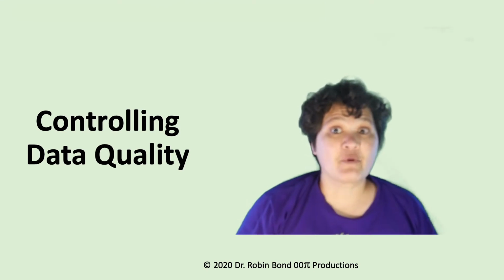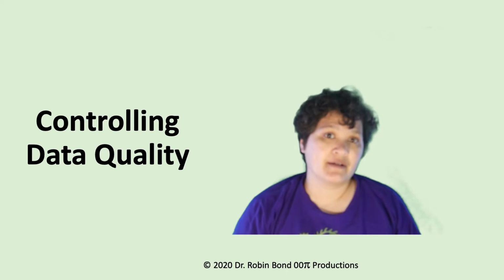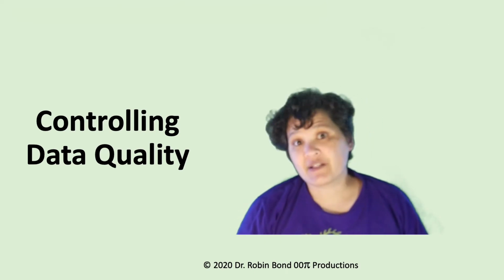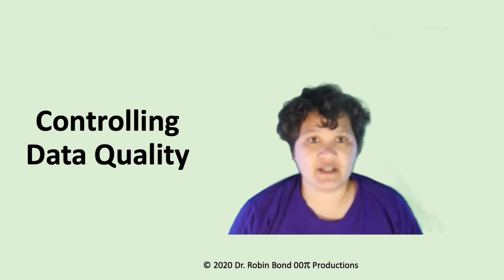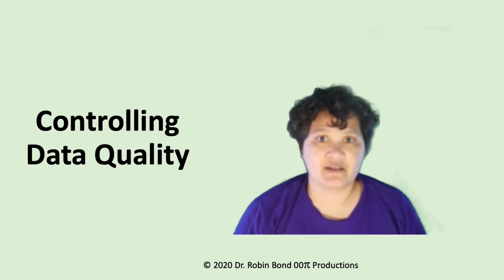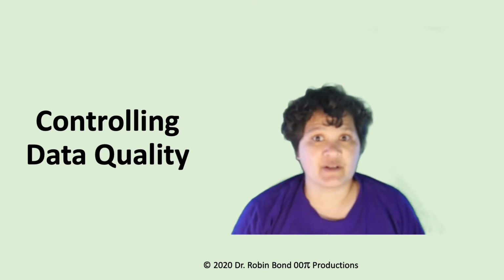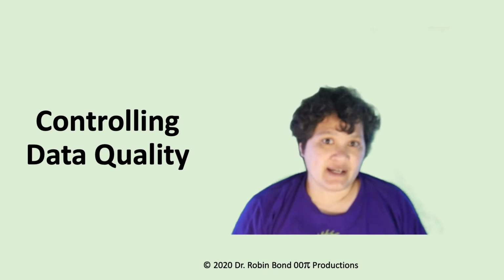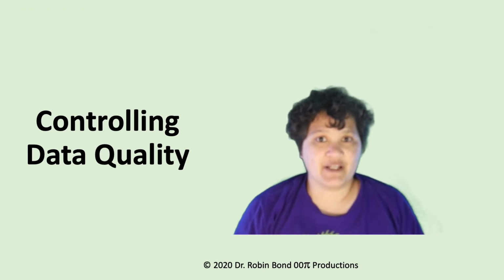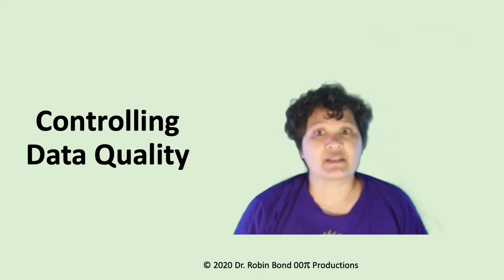Hi, today we're going to talk about some ways we can improve our data quality. To do this, we're going to think a little more deeply about some of the topics we touched on in our first week, and we're also going to delve into some new topics. Now, I'm dividing the ideas we're going to cover into three categories: staying within the dynamic range of our instrument, preventing and/or identifying contamination, and verifying that our method is operating the way it's supposed to.